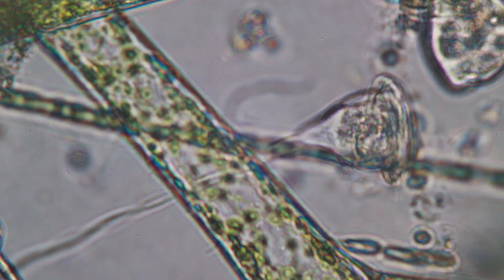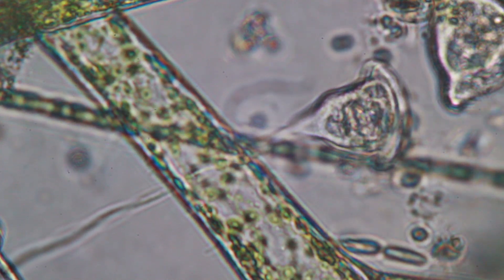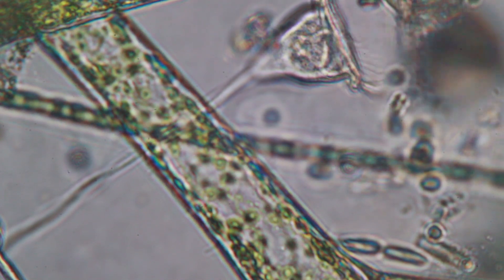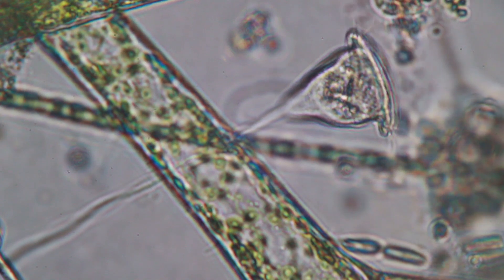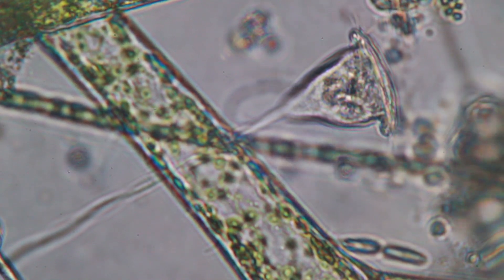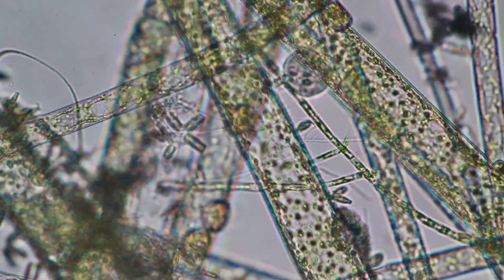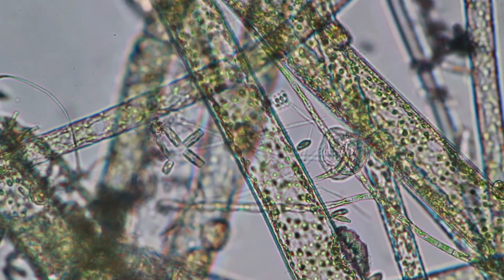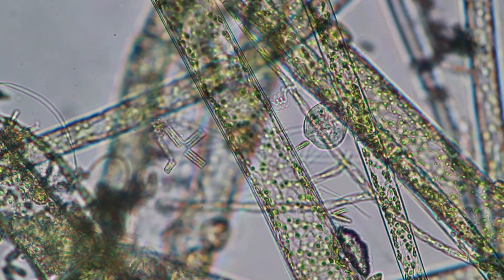I was kind of hoping to find maybe some paramecia or some kind of worms, but not so much here. I did find a so-called vorticella — the one you see on the right. You can see a stalk which extends very far to the left and it retracts very quickly. I was actually waiting for quite a long time for it to do this again. On the head of this bell-shaped organism there are a whole bunch of cilia that move very quickly, so they're kind of difficult to see. It's a little bit inhibited by all of the algae around, so it's not able to move very freely.